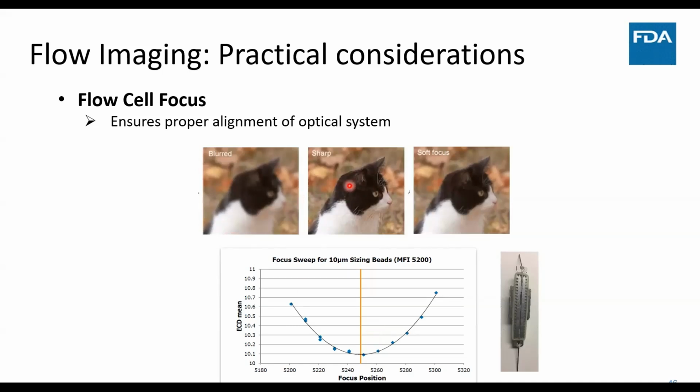You could see in the middle here, a very sharp image, but then as you look at the blurred image, you could see some components of our cat are missing. The cat here has no whiskers, right? The sharper the images, the better our ability to determine the size, but also the morphological parameters of our product, of whatever is in our product.